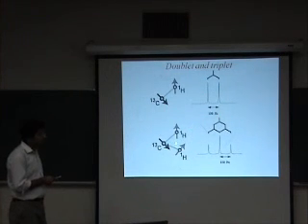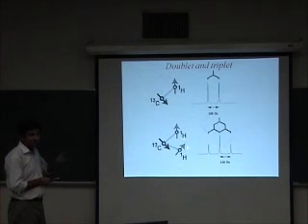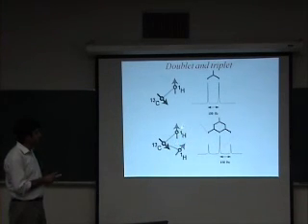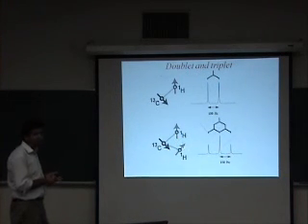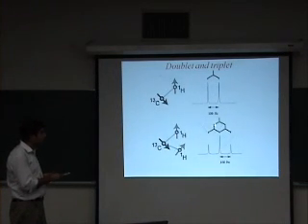Now both of these protons are equivalent. We will later on formally describe what is meant by equivalence, but naively or intuitively we know that these protons are equivalent. So as a result of the carbon-13 being coupled to the first proton, the first splitting occurs, and as a result of the carbon being coupled to the second proton, the second level of splitting occurs.